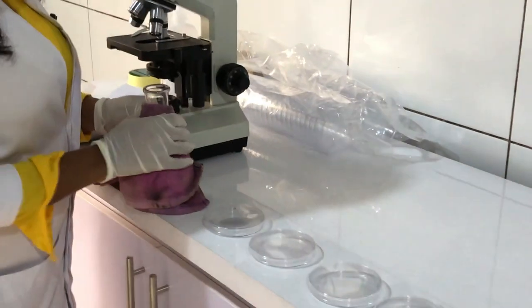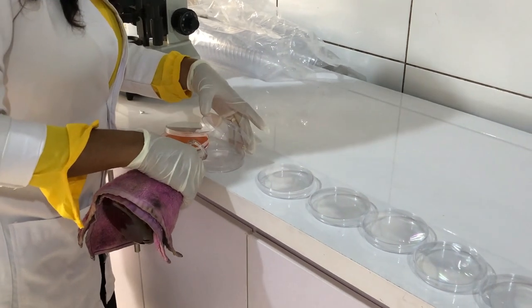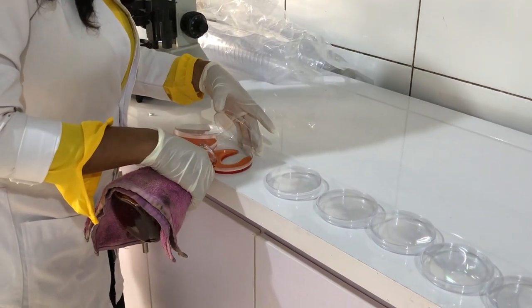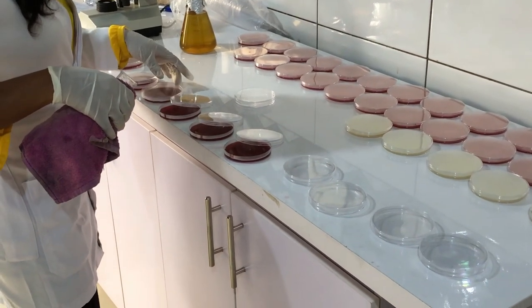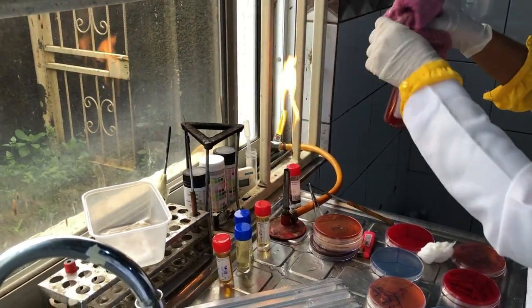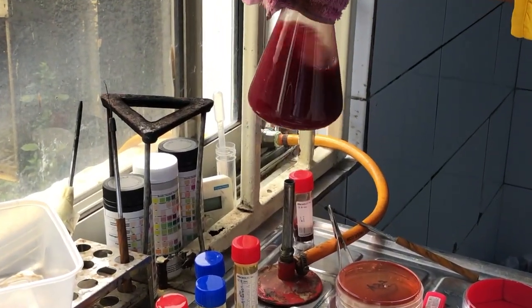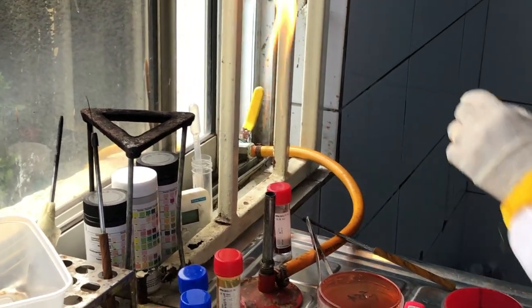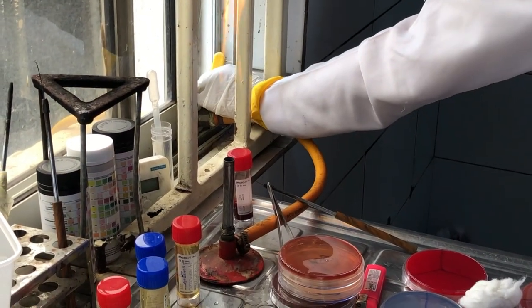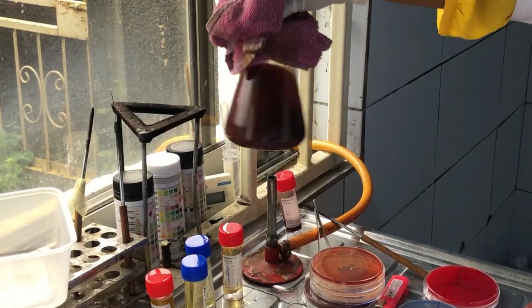I actually forgot to film the process of pouring the blood into the nutrient agar, but it's actually one of the prettiest things ever, at least to me. Anyway, my supervisor is just pouring it out, and after we're done dispensing the blood agar, we will begin to heat up whatever is left over until it turns dark brown — that's actually how you get chocolate agar. Chocolate agar is literally just blood agar that has been heated up so that the blood cells hemolyze and turn brown.